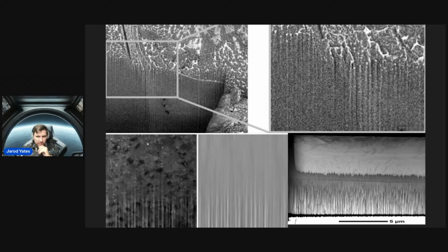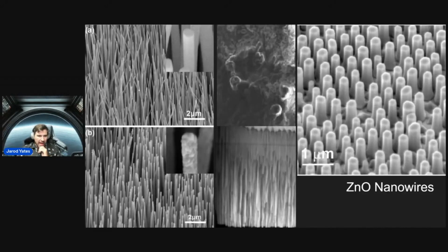It makes me keep open different possibilities that it might be something else, especially when we look at these nanowire structures. So like these little cylinders I showed you at the beginning, wow, those sure look like these guys to me, or at least, they look more like that than the curtaining that we're seeing here. Also, when we look at these vertical nanowire structures that have been built in other experiments, to me, I see more of a relationship there. But I'm not going to hang my hat on that. I'm just saying.